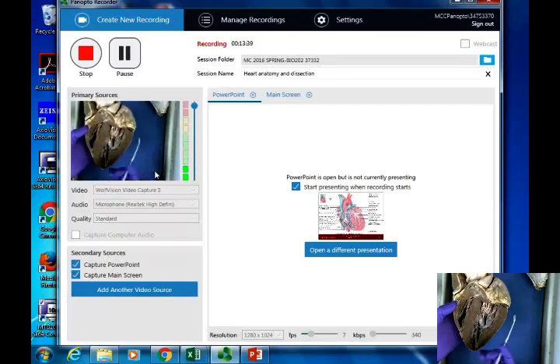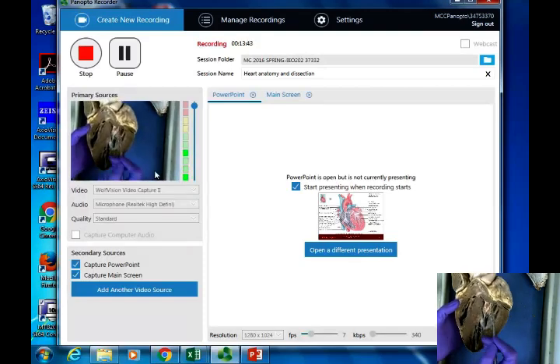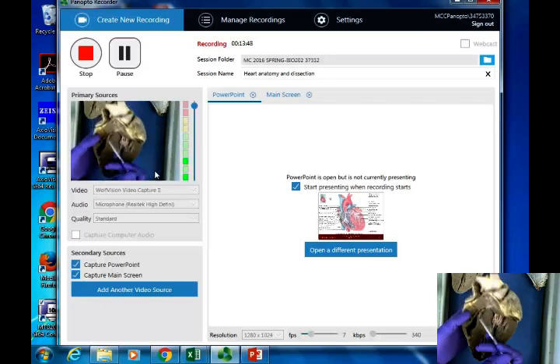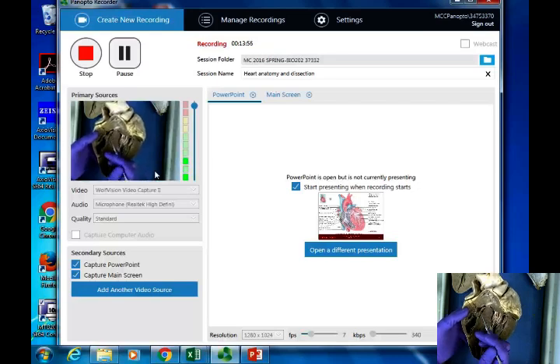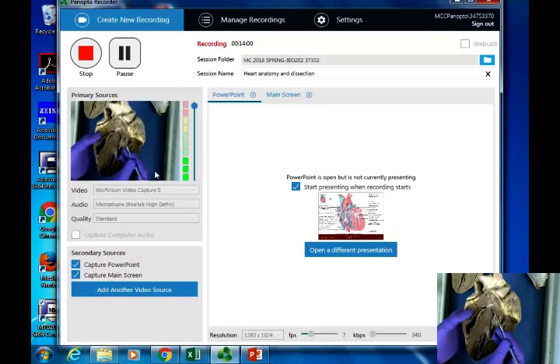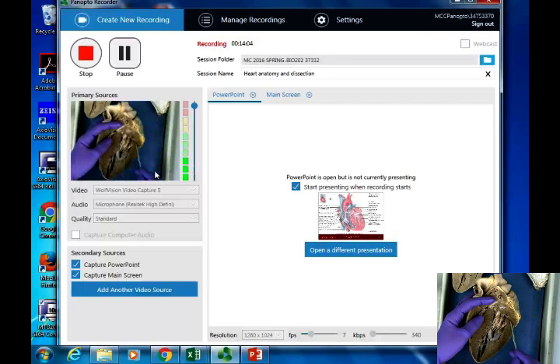Okay? Here are some good chordae tendineae leading up to that atrioventricular valve that goes up into the left atrium. Right ventricle over there. This one you can actually see. Here's the right atrioventricular valve with the chordae tendineae attached to a papillary muscle there and there. Here's part of the valve here too. And then in terms of exiting, this right here, over on the side, blood comes in this way, goes out in a V-shaped pattern, goes up over here.